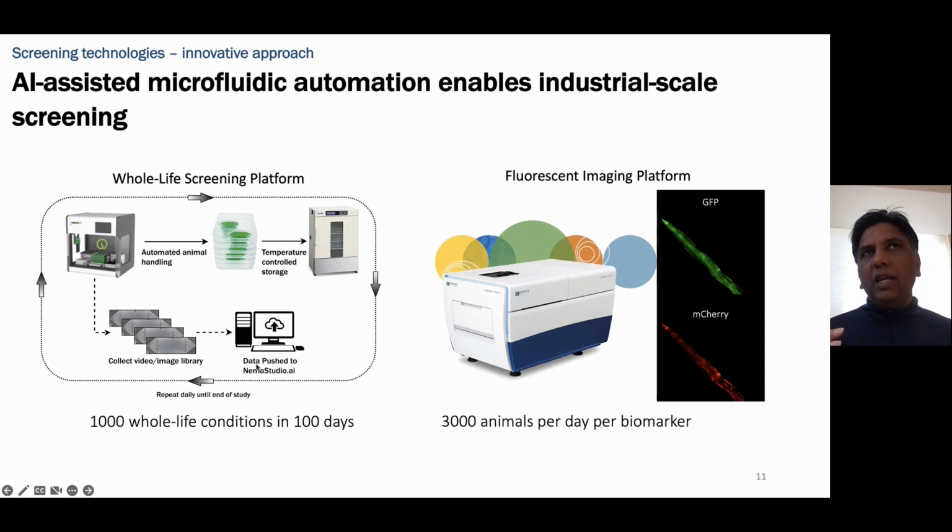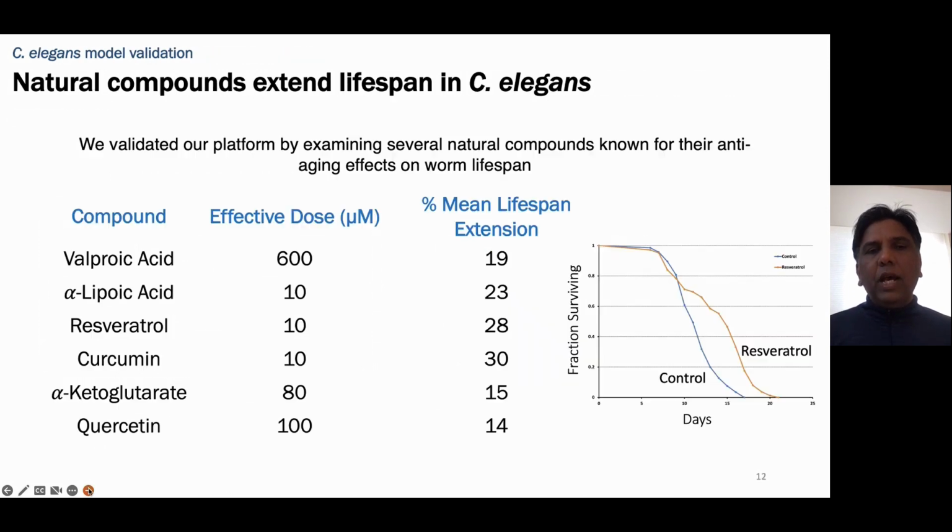So that means by integrating both the organism level readouts as well as looking at the fluorescent features at the level of organelles or cells, we can get a significant amount of depth in the phenotypic space to understand how these drugs are actually acting in terms of the pathology which you are interested in.